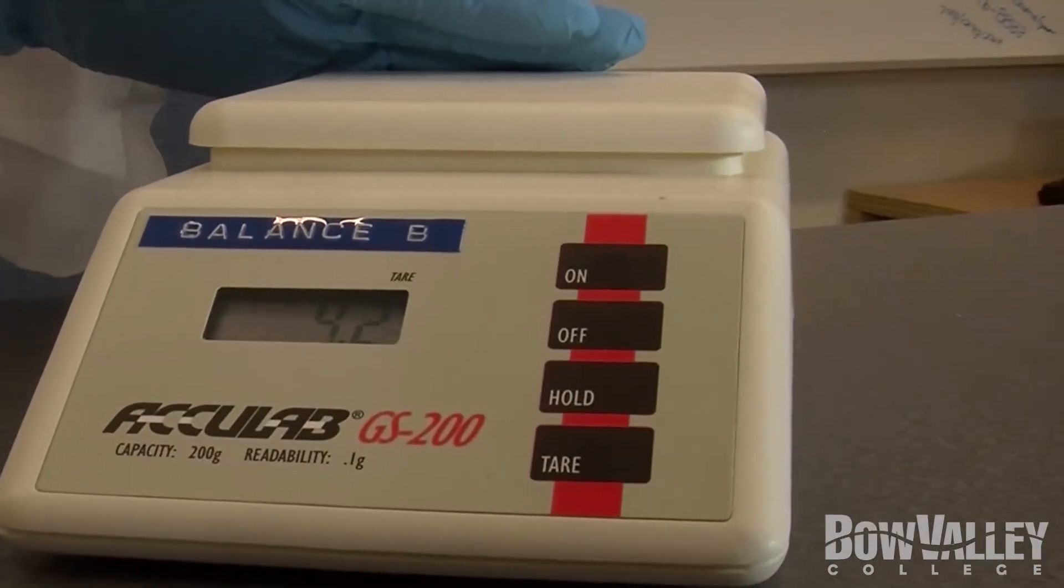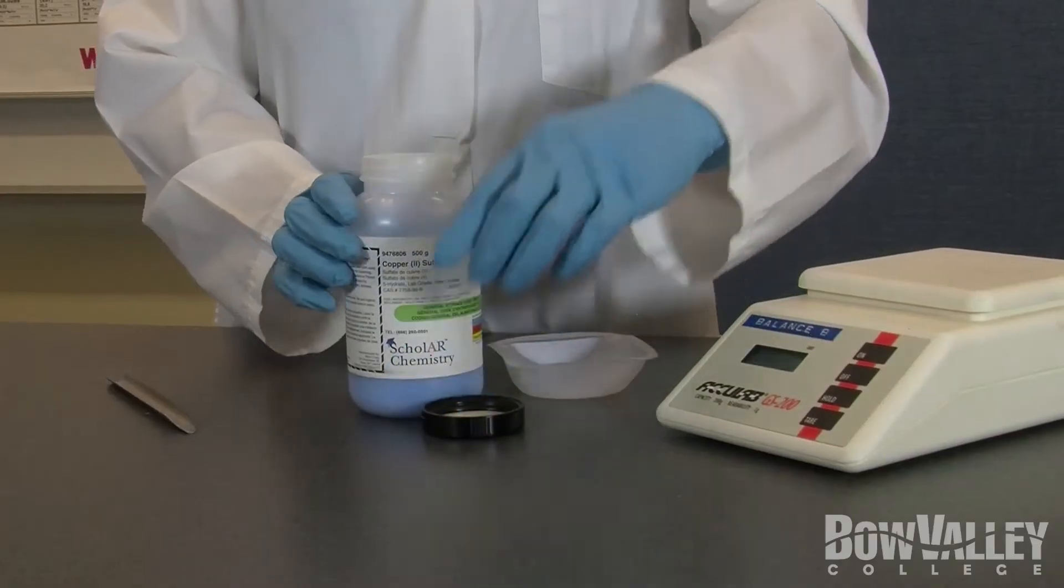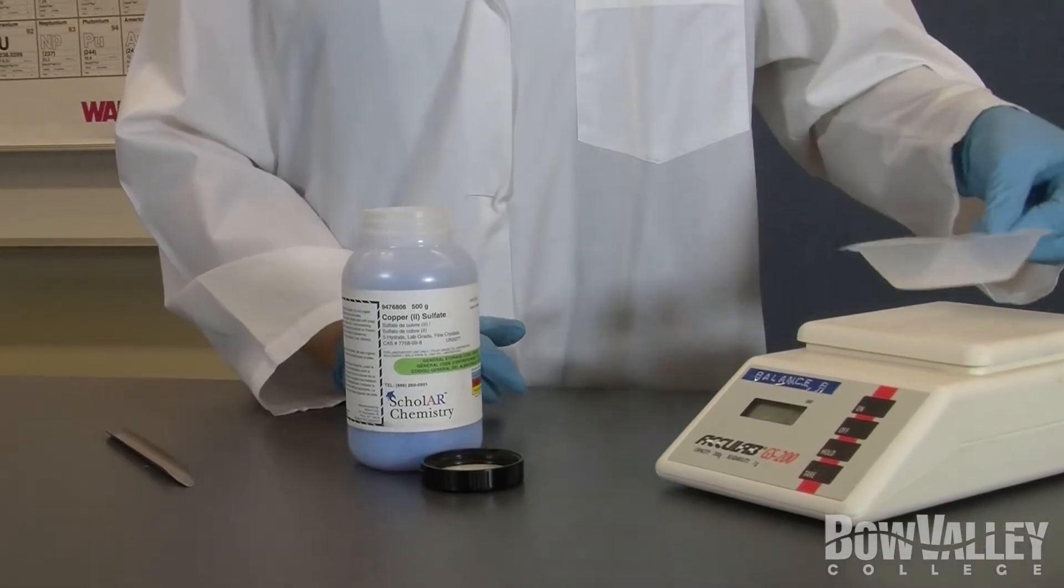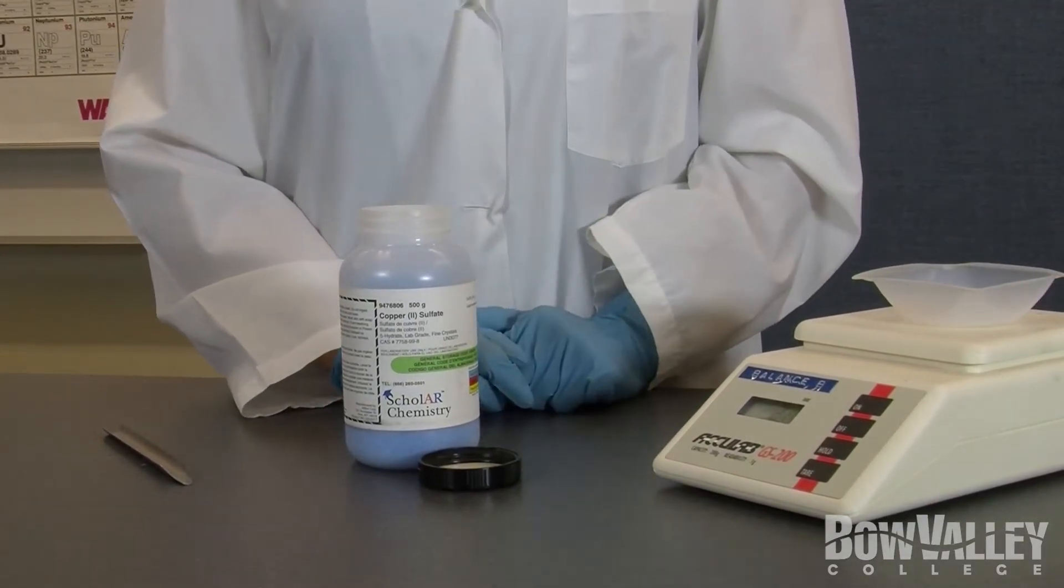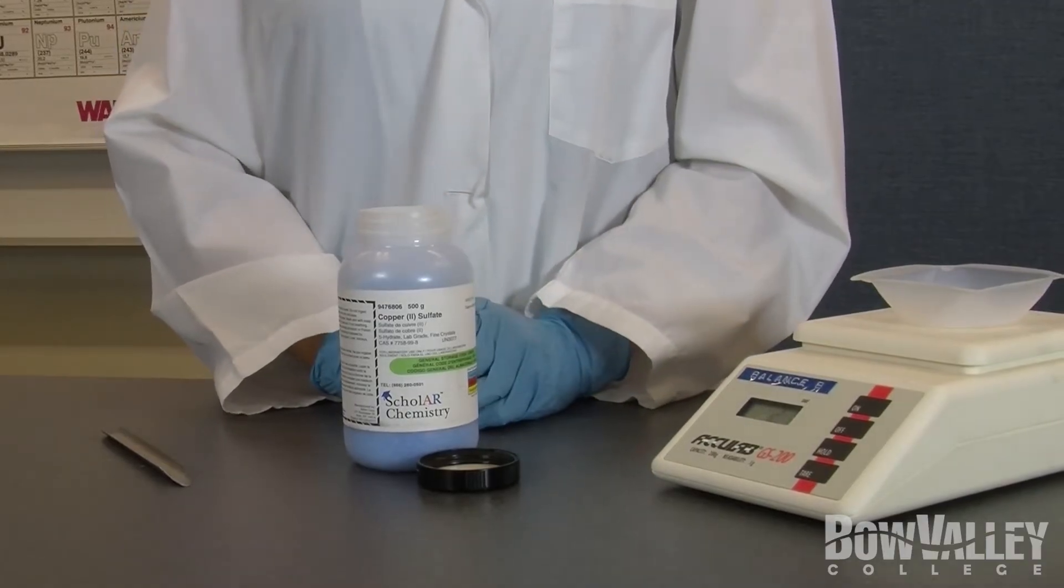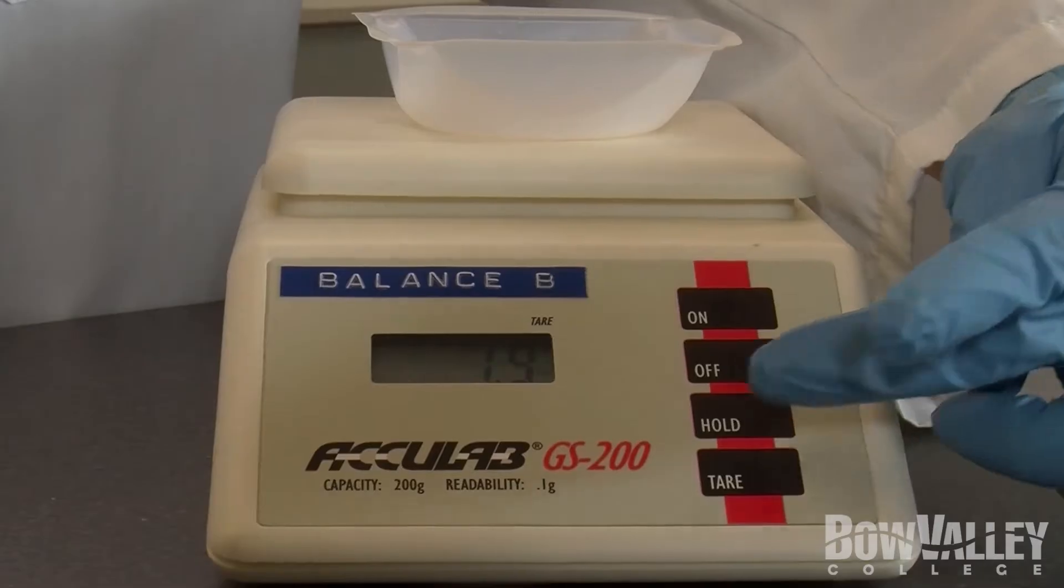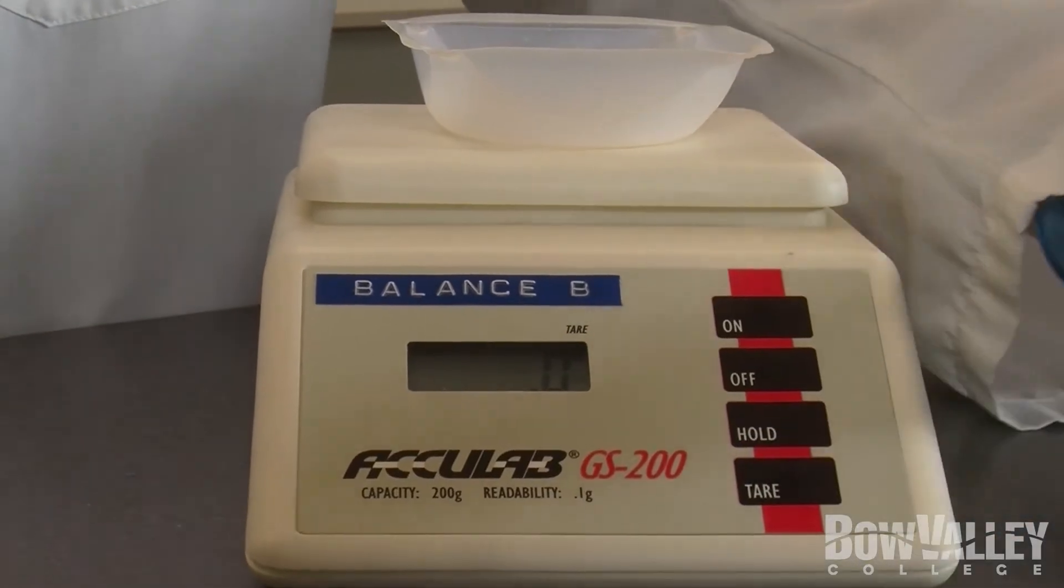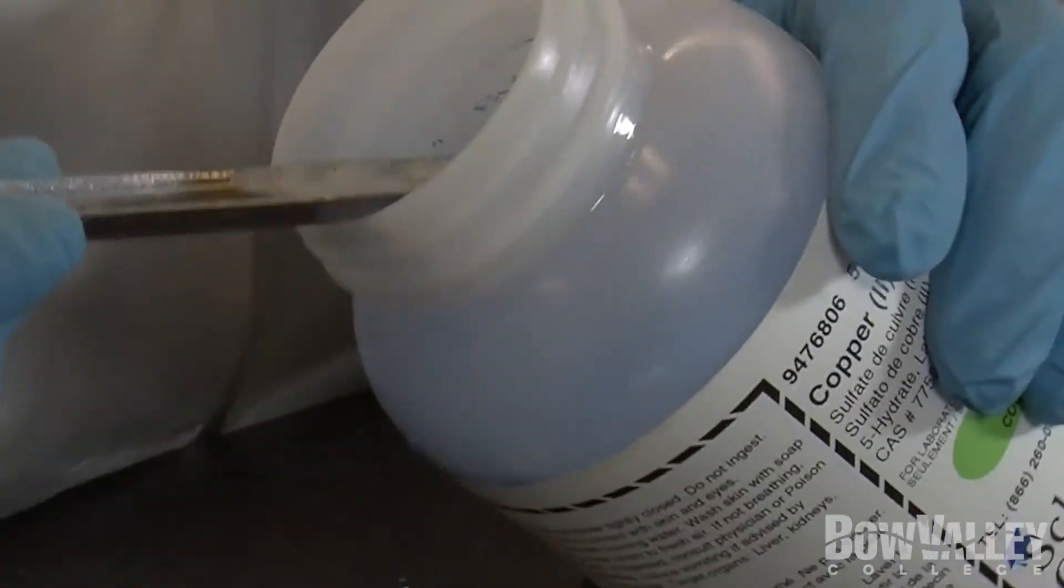First we need to take our copper(II) sulfate and have it ready to start measuring. Put our weighing dish onto the scale. You will see a value of 2.1 on the scale. We need to tare that, which means it takes away that value and all we'll be measuring is the product inside the weighing boat.